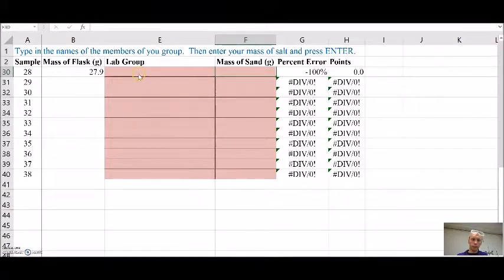All right, let's try this again. I'm feeling good about this one. I was particularly careful. Here we go. I got 2.3 grams of salt. All right. Well, still not perfect, but I'm getting better. And that's the whole idea. Keep progressing until you get the best result you can get. Your goal is to try and get a percent error of zero. But the more trials you do, the more likely you're going to get a better result.